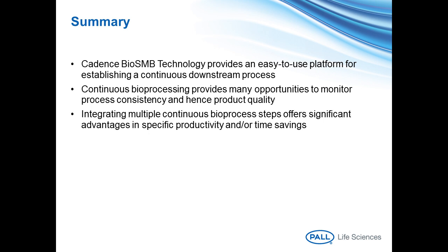And the last bullet point is actually quite important, because if you integrate multiple continuous bioprocessing steps in a smart way, the added value is tremendous. I just mentioned already that combining the pre-concentration through an ILC or SPTFF with a protein A capture in a BioSMB, the added value is much higher than just using the BioSMB as such, and much higher than using the ILC as such. So smart combinations of continuous bioprocessing steps can give tremendous advances in terms of specific productivity and/or processing time.